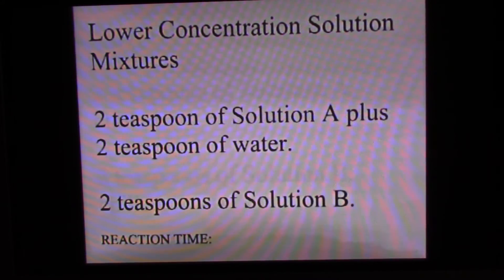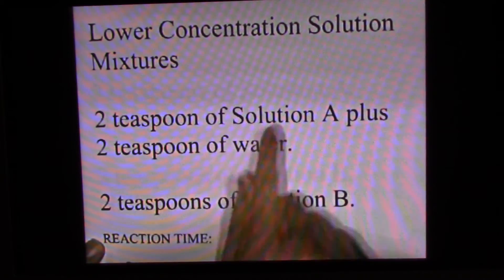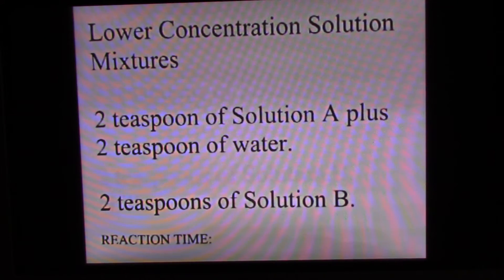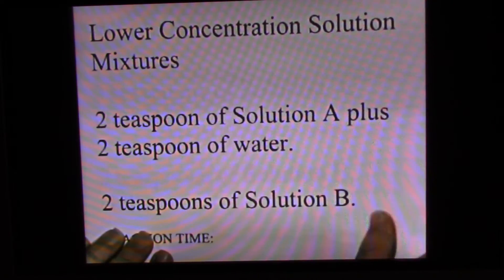The next reaction will occur at lower concentration. To make a lower concentration, we took solution A and added extra water to dilute it, so the amount of iodate per volume is less. We added two extra teaspoons of water, so there's not as much iodate per unit volume. Solution A is less concentrated compared to the reference solution.